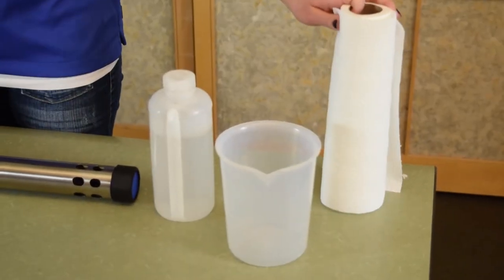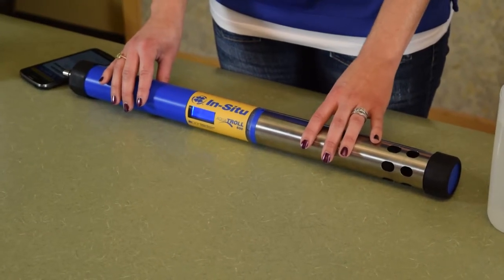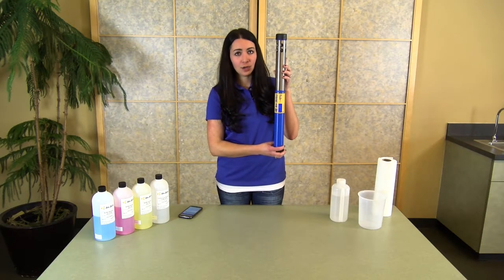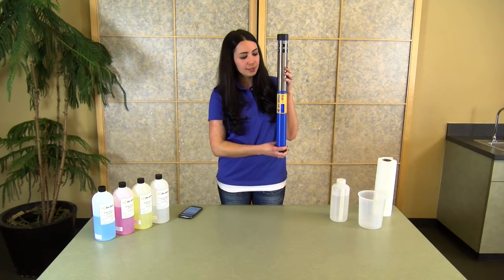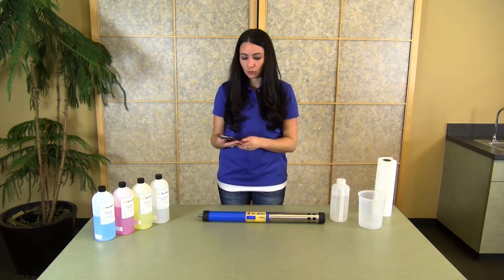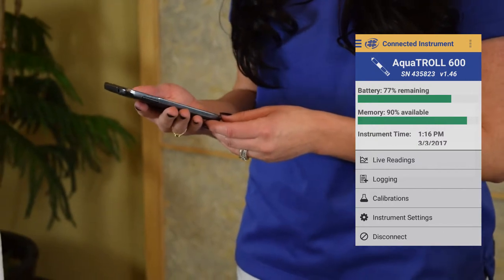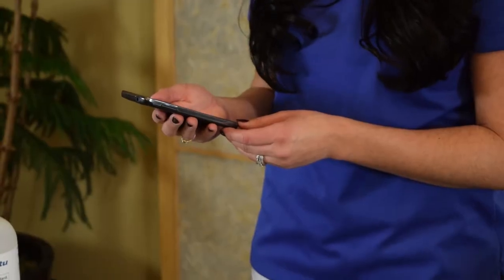It's always good to have a roll of paper towels handy when doing calibrations. Before you begin, you will want to connect your instrument to either your Android tablet or your laptop computer. To do so, hold the instrument inverted at 180 degrees to activate your Bluetooth. As soon as your LCD display lights up, your Bluetooth is also activated. Once activated, you will pair your instrument with your device, and it will find the instrument and bring you to the connected instrument screen so that you can get all your information and perform all your calibrations.